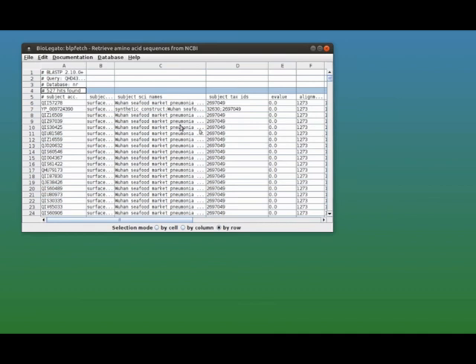So we can see a number of things. First of all, there's actually quite a large number of hits, and a very large number coming from the Wuhan seafood market, so that means the data set is going to be a little bit skewed. Also note, we can see here by examination a synthetic construct, so we'd like to get rid of things like that from our data set.